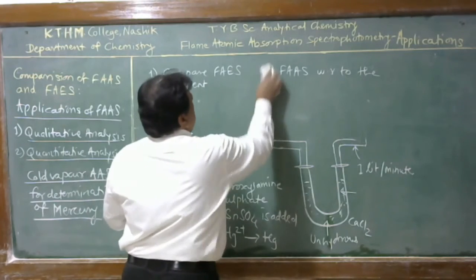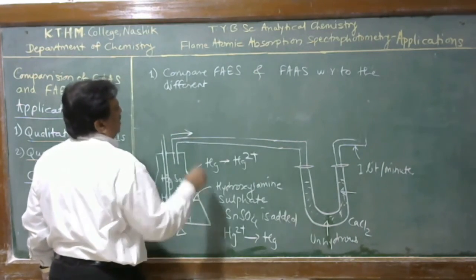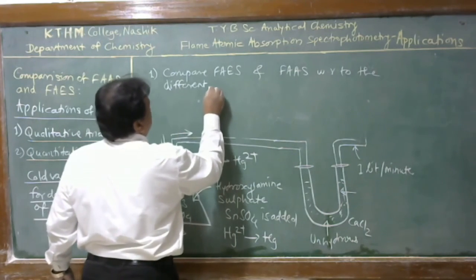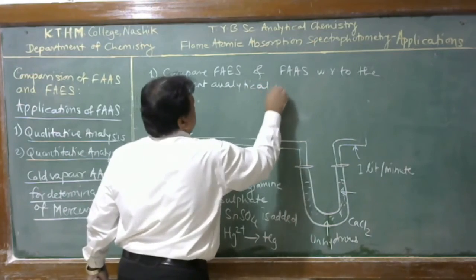Compare flame atomic absorption spectroscopy and atomic emission spectroscopy with reference to different analytical parameters.